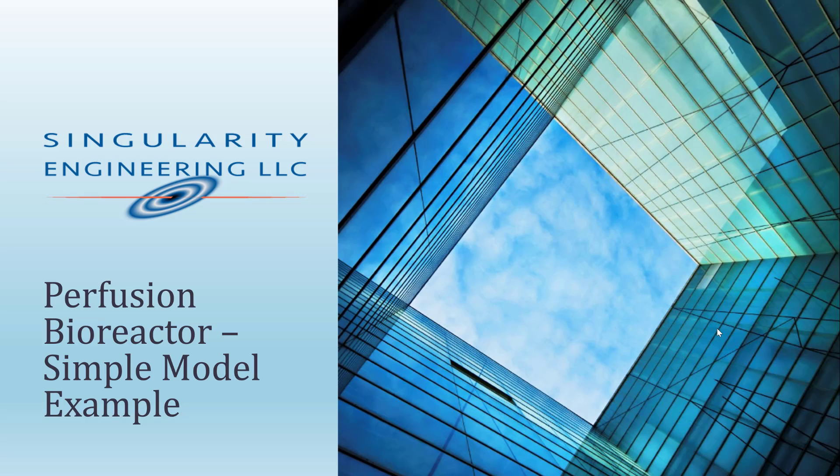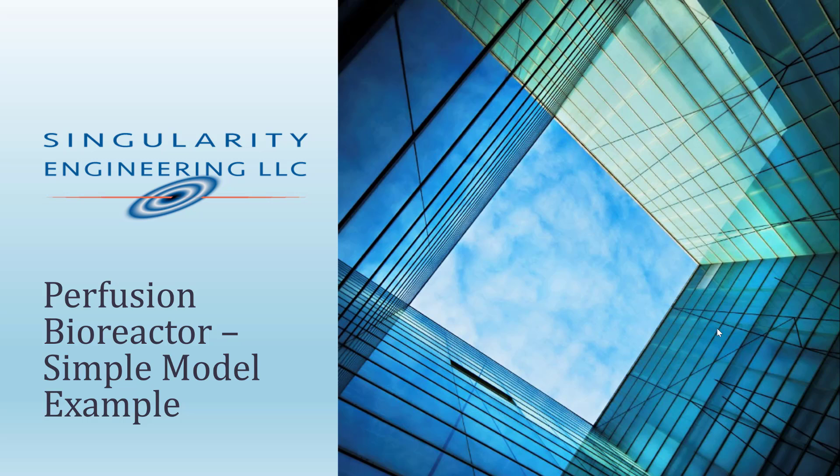Hello, my name is Jesus Ramirez from Singularity Engineering. Today I am going to talk to you about how to set up a model for a perfusion bioreactor using CFD and particularly using ANSYS Fluent. I hope you enjoy this video.